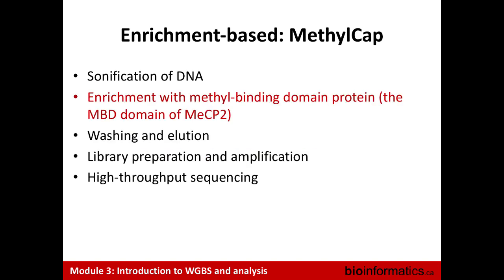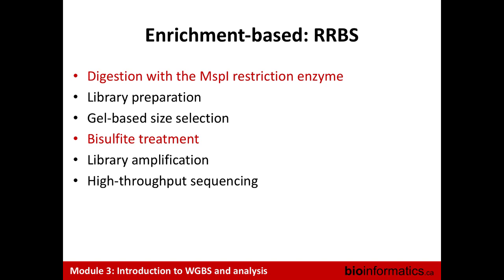Okay, so a similar enrichment-based approach, but here at least the library prep comes later. Maybe it was a mistake in my other slide, but here the difference is that we're targeting a methyl-binding domain protein, and similarly, you measure the enrichment that you're getting in the different regions. I'm coming to the end of the enrichment-based approaches.